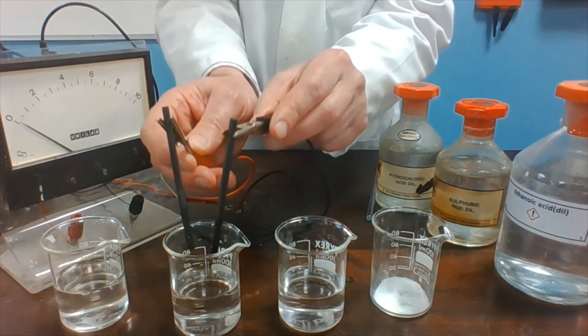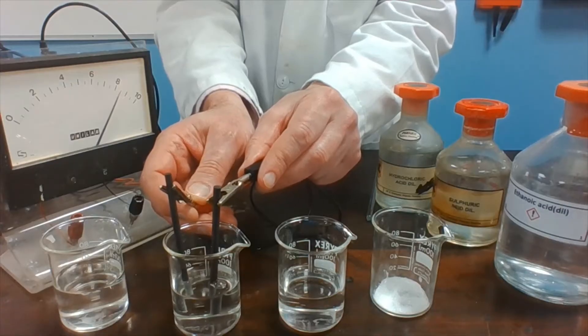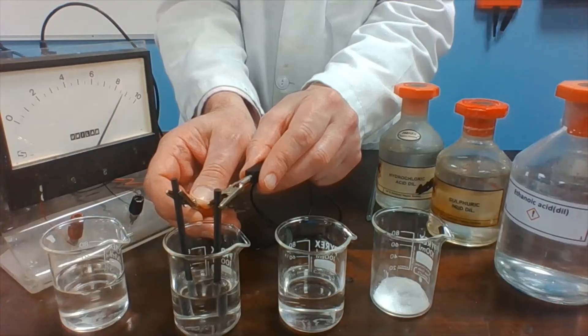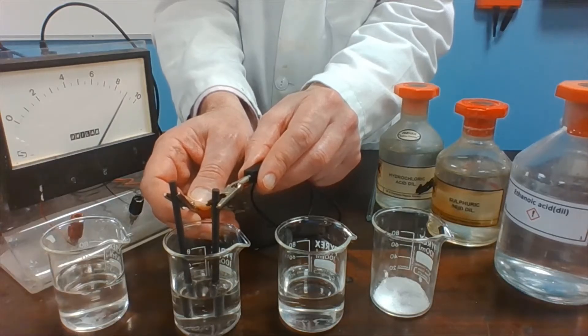If we now move to the sulfuric acid. Again, it registers on the ammeter, so a current is flowing. And once more, you can see bubbles of gas coming off at the electrodes.